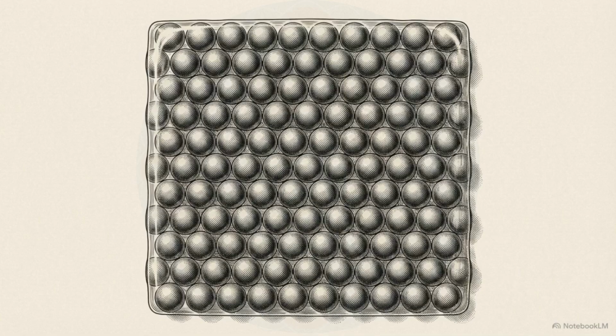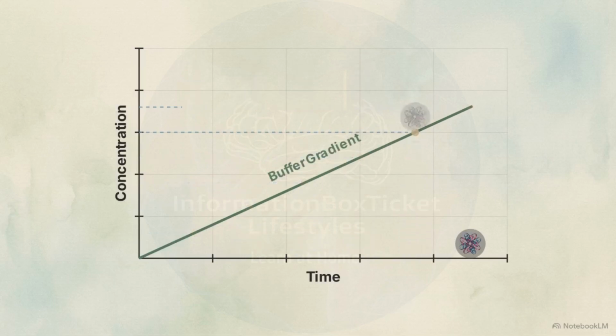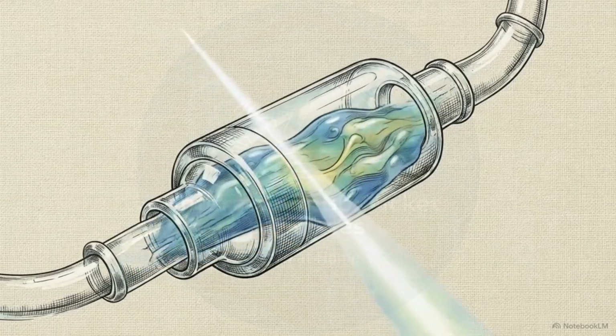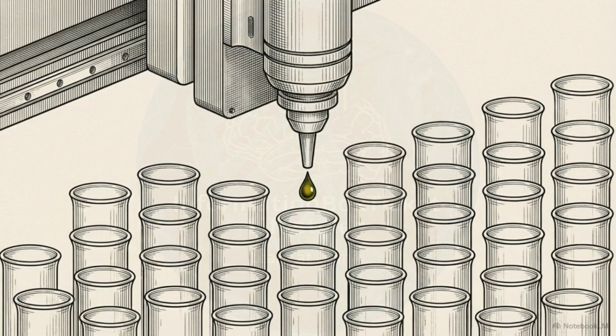To release proteins stuck to the beads, the system begins a phase called elution. Elution is the deliberate process of washing bound target molecules out of a column by altering the surrounding fluid. The system gradually changes the salt concentration, or the pH of the fluid gradient, forcing the proteins to detach at highly specific intervals. As the fluid exits the column, inline UV and conductivity detectors actively monitor the stream in real time. The moment they spot the newly isolated protein, they trigger an automated fraction collector to catch it safely in individual tubes.